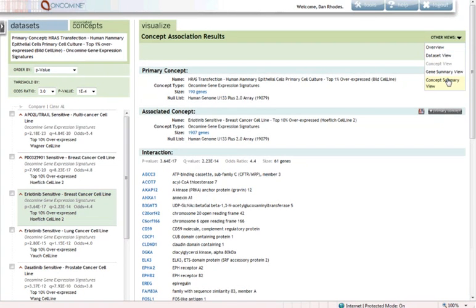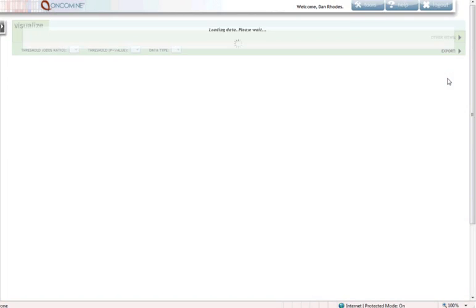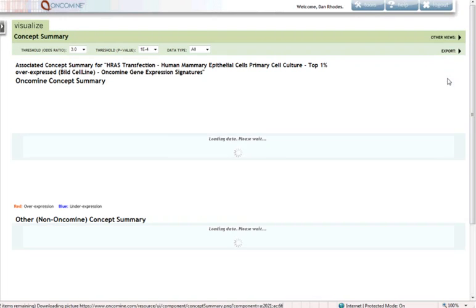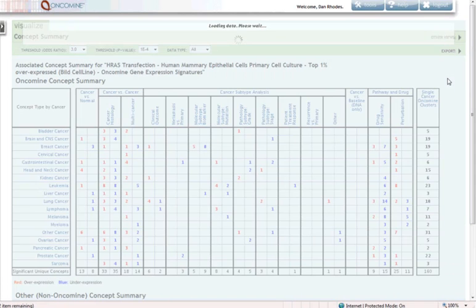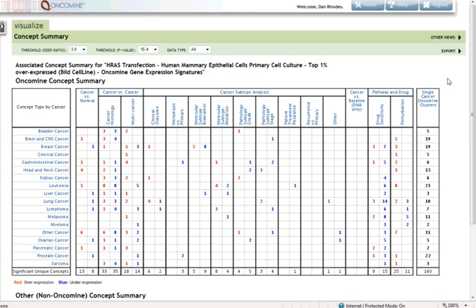As you see here from this summary view, we started with this pathway activation signature. We can quickly learn about the biology of the signature of genes, cancer types where it's overexpressed, cancer subtypes where it's overexpressed, drug sensitivity associations, and other perturbations that are associated with RAS pathway activity.